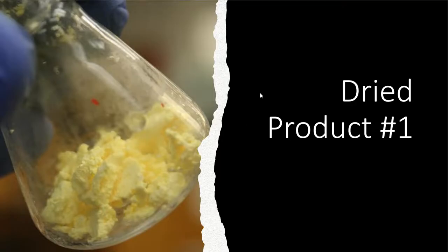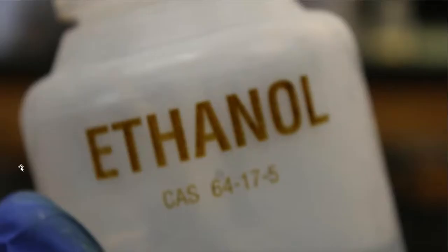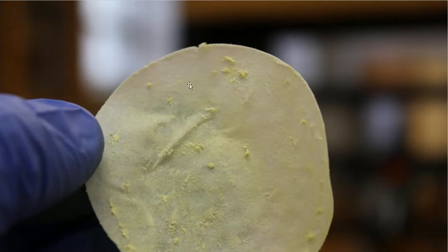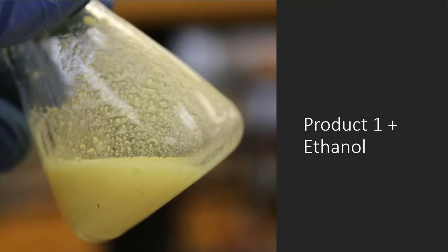I know how to do this. All right, so here is my product that's dried. I'm going to go get the ethanol jug that we have swimming around in the lab. We always have it out, just like a DI water bottle. That's stock. Then I'm going to transfer all of my crystal down into that Erlenmeyer flask. I have little remnants left over, so I'm going to squirt this filter paper with some ethanol to get rid of some of that and put it into that flask.